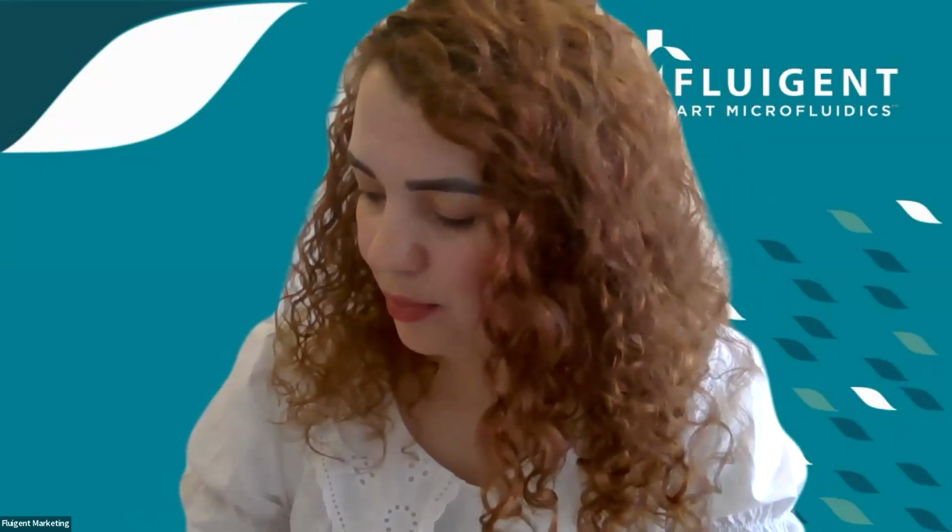Okay. I had a question, and I think you already mentioned it, but I just wanted to be clear. If we compare your IBEX traditional method of doing it, how much time would you spend compared to if we connected to the microfluidics and connected to Aria?